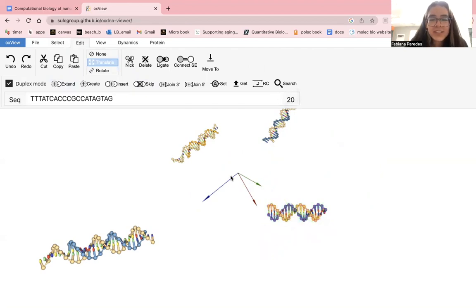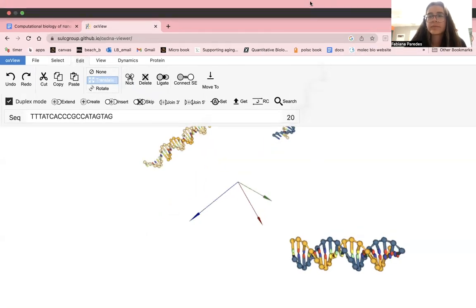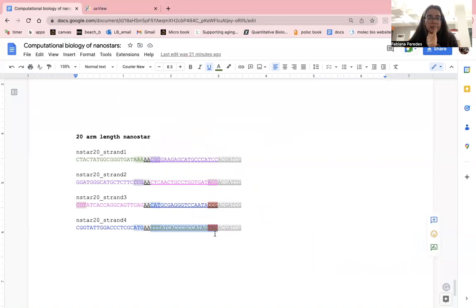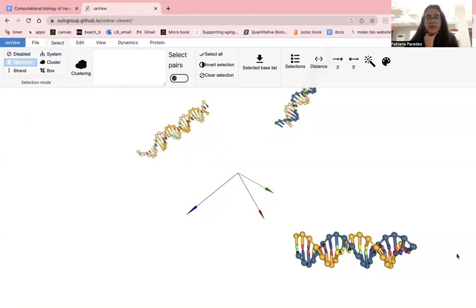And now we can zoom in on it. Oh, I don't have. Okay, well, okay. Well, hopefully it doesn't, okay, it's fine. It's easy, we can do it fast. We will see. Okay, we're looking for 3 T's, so we can add 2 A's. 3 T's, perfect. So we can add 2 A's. Click. Oops. Edit. None. Select. Okay, it's already been selected.